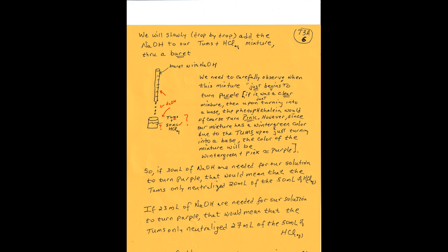remember, phenolphthalein turns pink in a base. But because of the wintergreen color, instead of turning pink, the phenolphthalein will make the mixture turn purple, because the wintergreen color of the liquid, because of the Tums, plus the pink color from the phenolphthalein when it turns base, will make the solution turn purple.